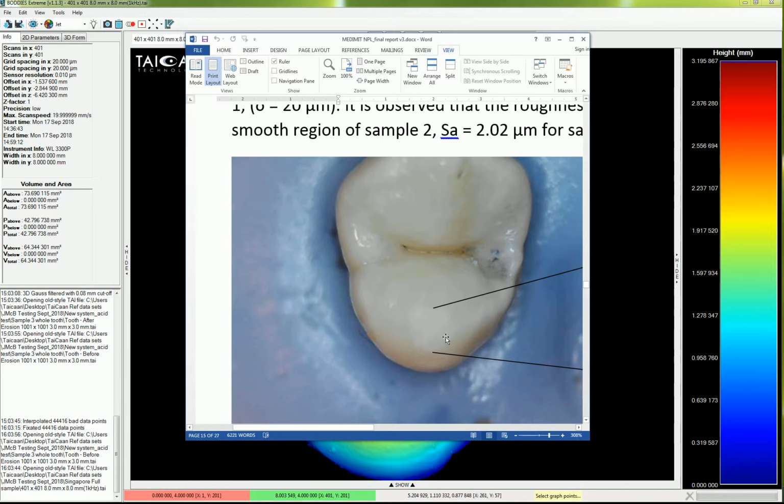And actually this particular photograph was after the wear study had taken place, and what we did here is we applied, in a 1.5 millimeter diameter section, some diluted citric acid, corresponding to the strength of something like orange juice or any acidic drink. And you can see the effect that's had. The test was for 1 hour. The diluted citric acid was not agitated, it was just sat upon the tooth. And you can see it's basically whitened the surface here.